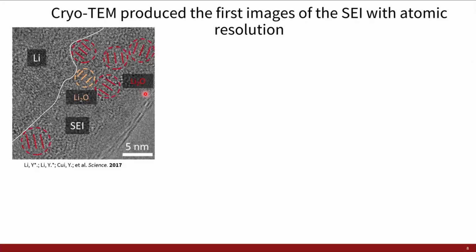But more interestingly than just the lithium metal lattice, we can now actually image the lithium metal SEI. And this image here shows the lithium metal lattice interfaced with the surface layer, the SEI, and vacuum out here. And basically this SEI consists of crystalline components such as lithium oxides and lithium carbonates, that orange guy should say lithium carbonate, kind of embedded in a more amorphous matrix, which is presumably the soft SEI compounds.